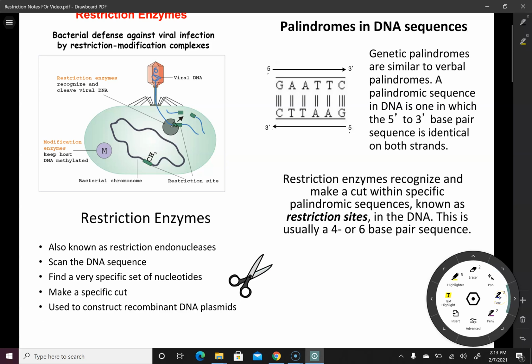Good morning, everybody. Today we are going to look at mostly review material, but some of the new versions of what we've already learned. So you already have this in front of you, or if you don't, it is on our website, for those of you at home. And we're going to talk pretty much today about restriction enzymes and what is ultimately known as a plasmid map. And we'll talk about how we can put all of those things together and also review gel electrophoresis and how to run it and how to map it out.